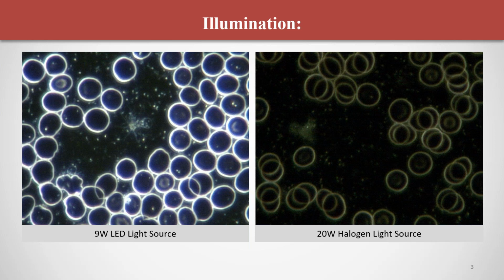And another very common anomaly is the fibrin that we see in the plasma, of course related to liver stress. Very common finding. We see it in a very high number of people, and very important to address when you see it. And in this 20-watt system, you will only really see fibrin if it's really extreme. So you won't really be able to see much pleomorphic forms at all then? Not at all. You'll see basically what you're able to see in Brightfield, with maybe 10% of the anomalies that you would need to see in Darkfield, and only really if they're quite severe.